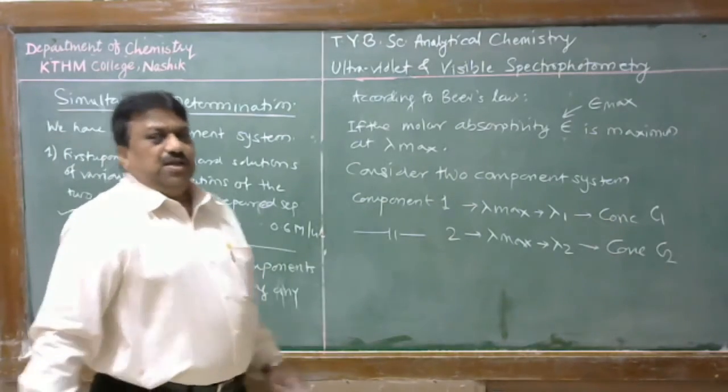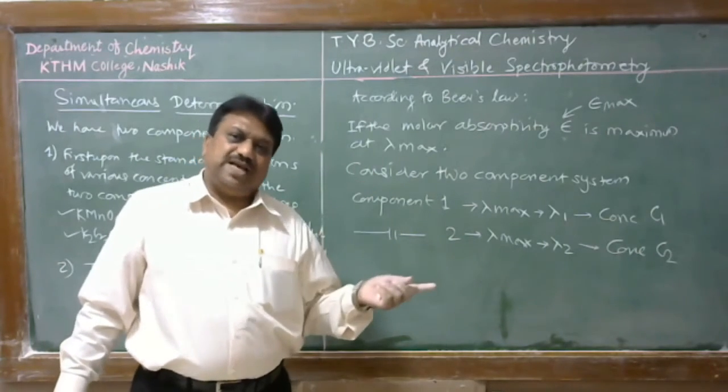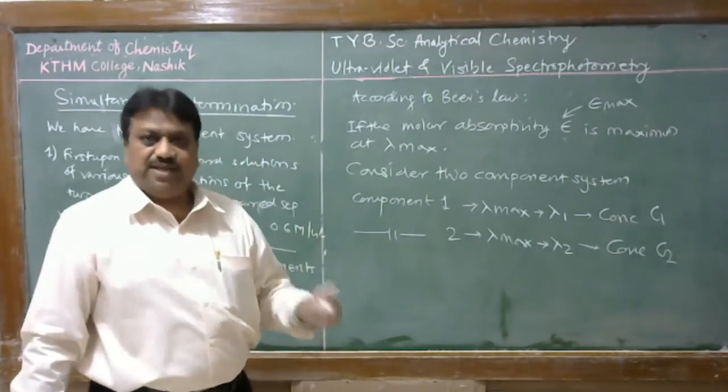That means if we have a 0.2 molar solution, that will absorb at the same wavelength as a 0.4 molar solution, which will again absorb at the same wavelength.